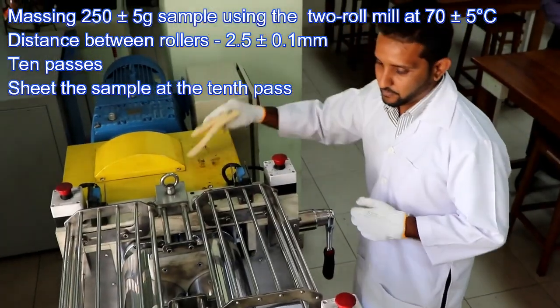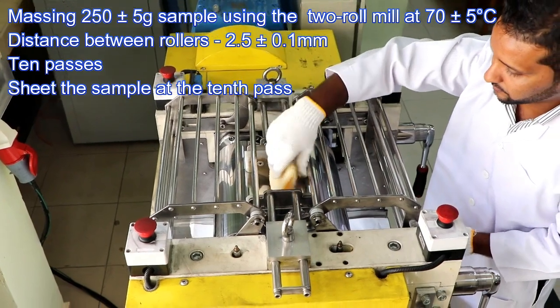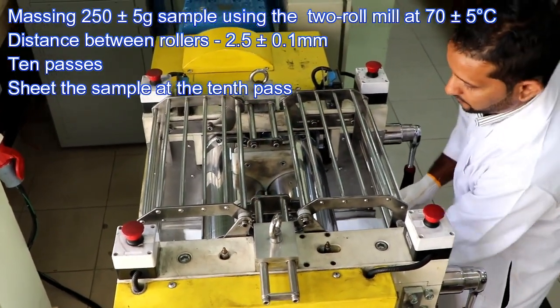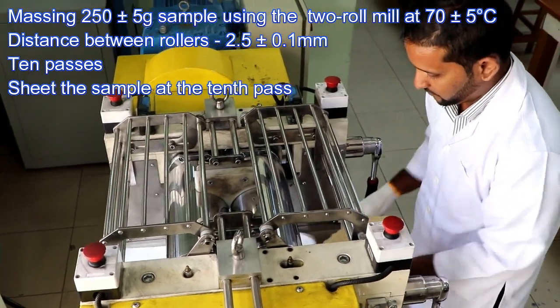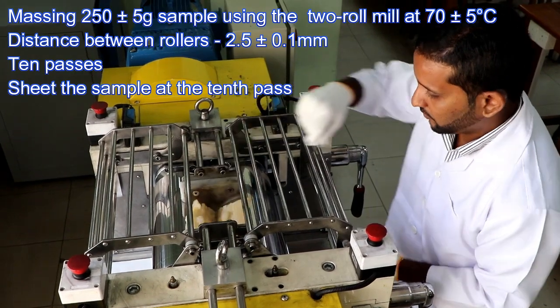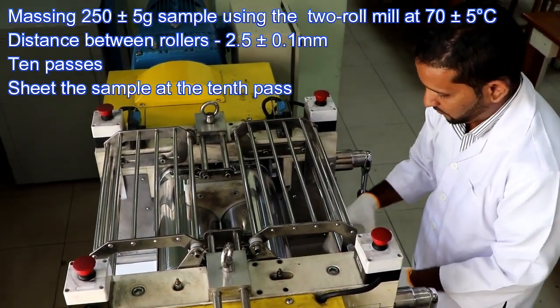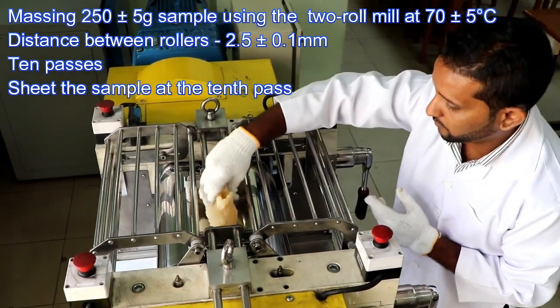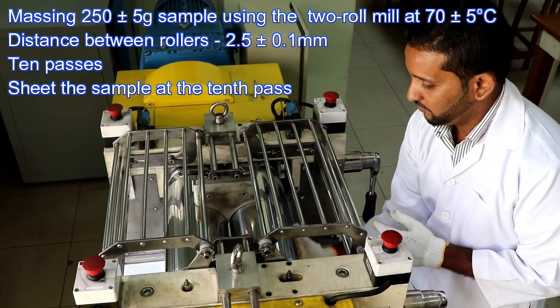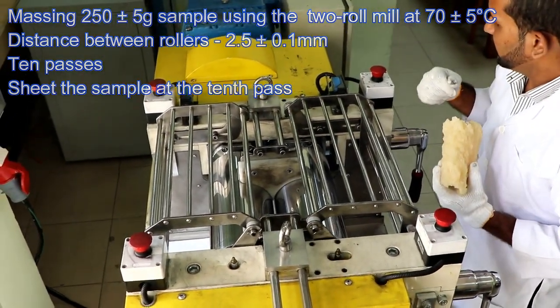So we do not allow the sample to rest between passes or to band on the mill rolls at any time during this massing. So roll the sample and immediately insert it endwise into the mill for another pass. Repeat this procedure until a total of 10 passes have been completed. At the end, sheet the sample on the 10th pass.